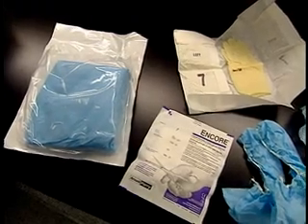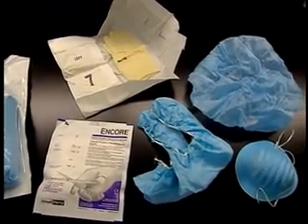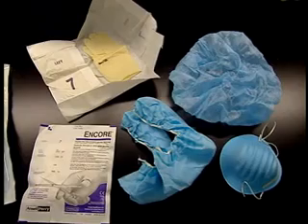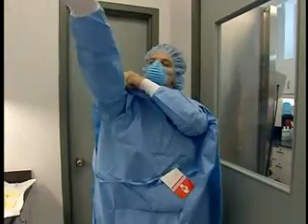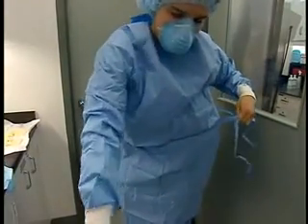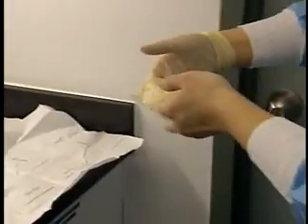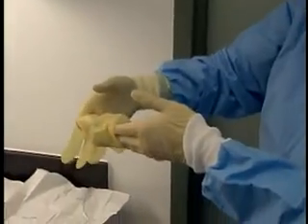When preparing antineoplastic drugs, you must use sterile equipment. You must always wear protective clothing in the room designated for the handling of these products. Wear a disposable, back-closing, lint-free, long-sleeved gown with tight-fitting cuffs that is water-repellent in the front. Before placing your hands in the cabinet, don powder-free, sterile surgical latex gloves. For your protection, double gloving is required.